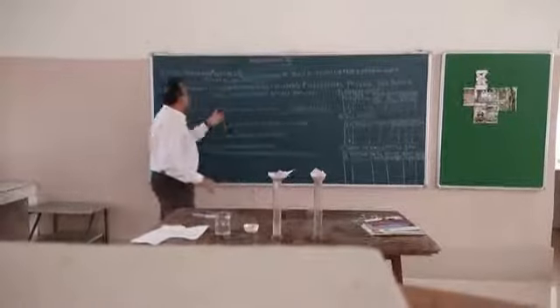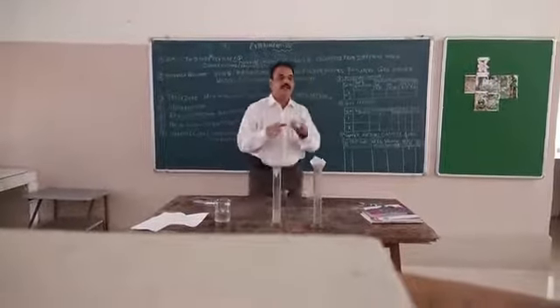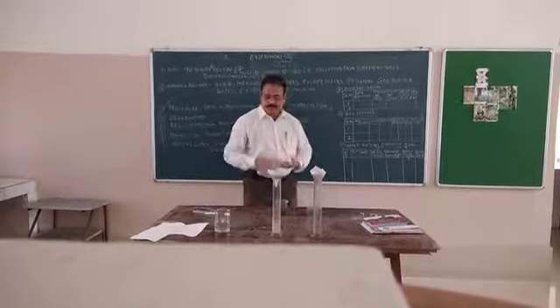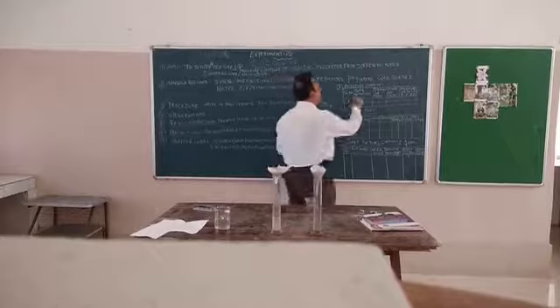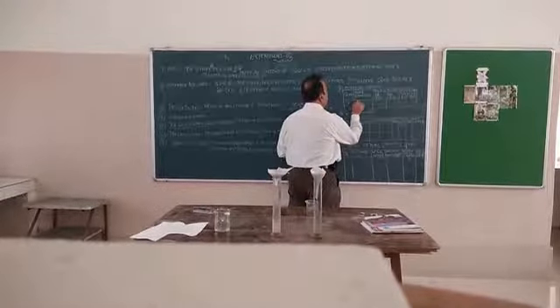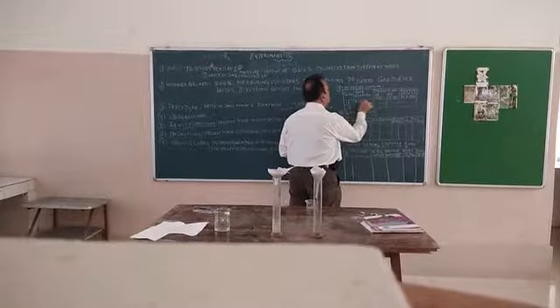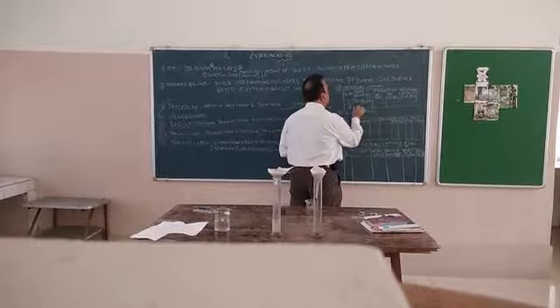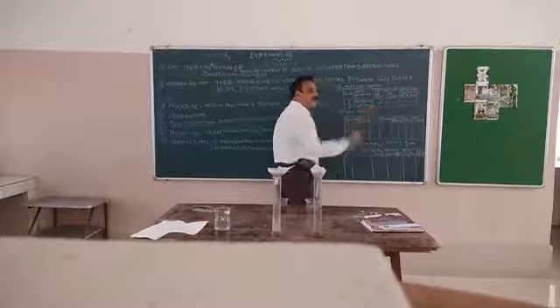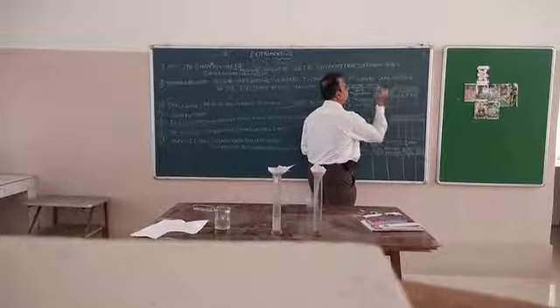And then second, the moisture content. Again, we measure the initial weight of the soil. We take the soil, like I have taken 25 grams. So let me put this soil sample. I have taken both 1 and 2. I put it as roadside soil, and another one is garden soil. So the initial weight I have taken is 25 grams and 25 grams.